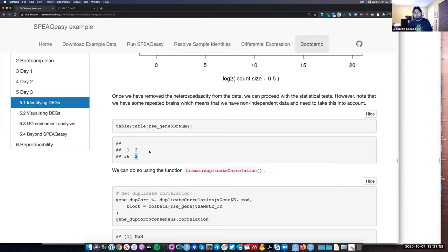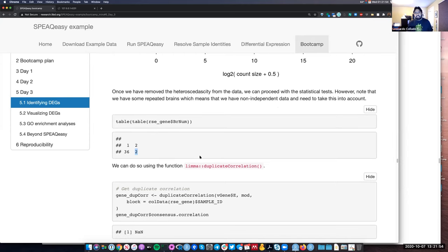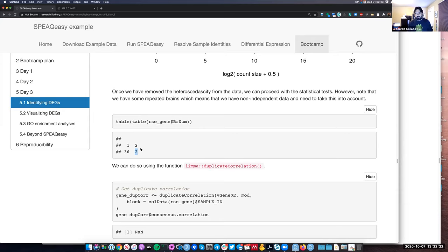The code that limma has to handle non-independent data — whether duplicated brains or a strong batch effect variable — is the duplicate correlation function. If there's a strong batch effect, we could try to adjust for it using this. The way duplicate correlation works is that you give it a matrix of expression. We created the vGene object from the voom function, which stores the expression under the dollar sign E element. We extract that expression, use our design model called mod, and introduce the block argument.